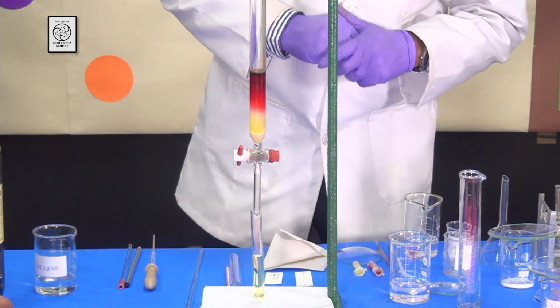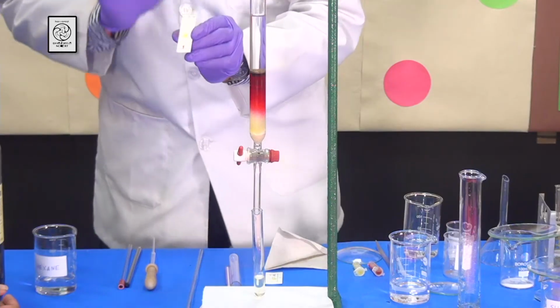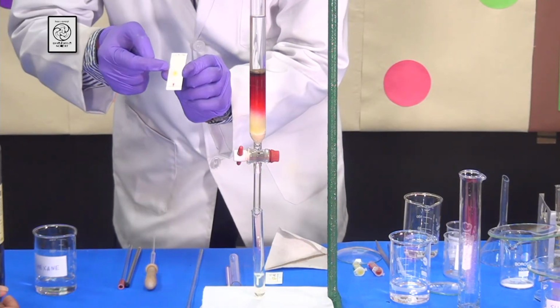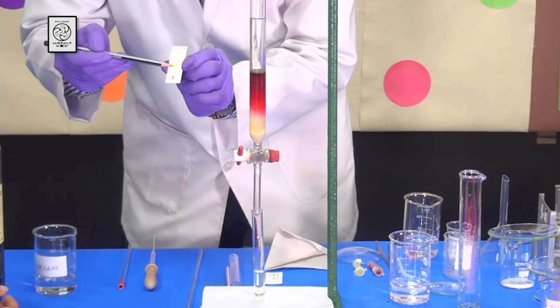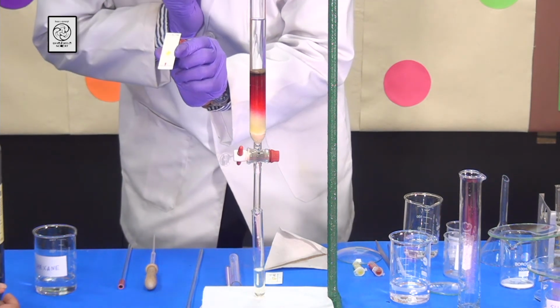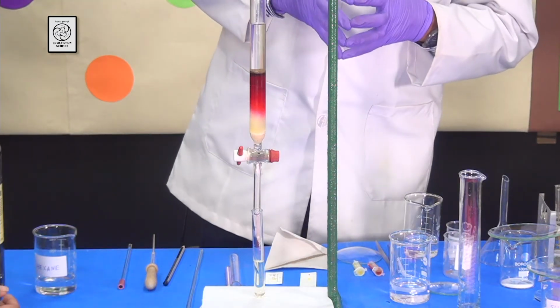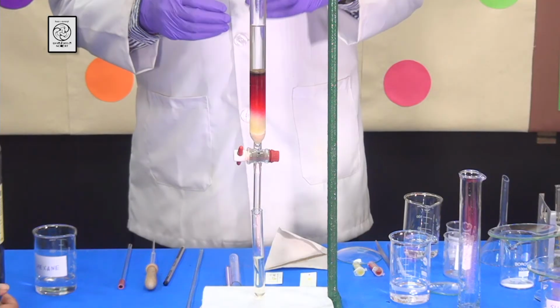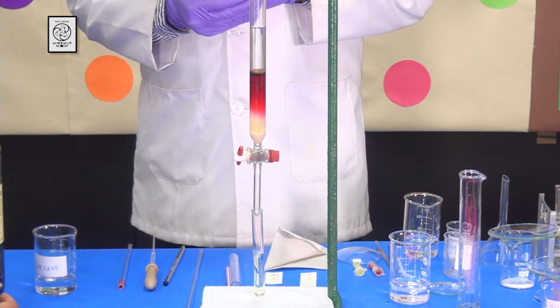Yes, sir. You can actually see a very nice space between the red one and the yellow one. There is actually a gap, which says that the separation is very good. You can see the same thing between the yellow one and the red one. The gap says that the separation is following the same as the TLC. Now, students, you can observe carefully that most of the yellow compound is already eluted. So, sir, now I can increase the polarity in order to elute my red compound.